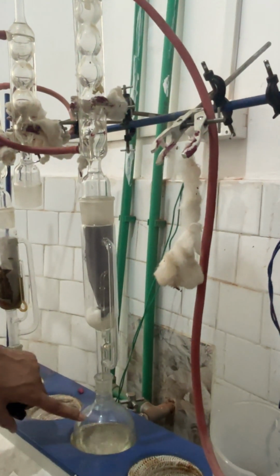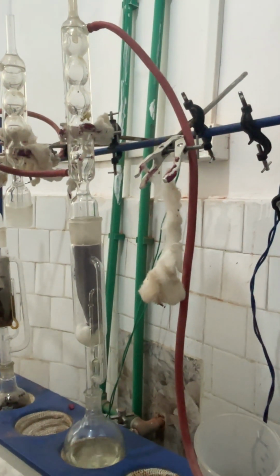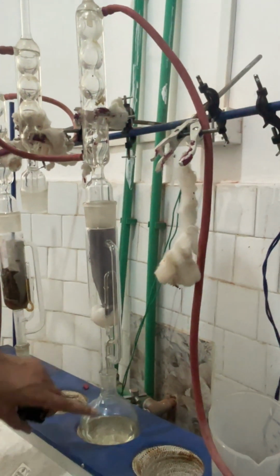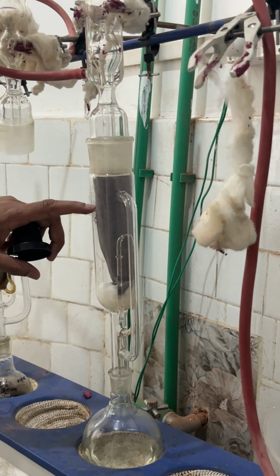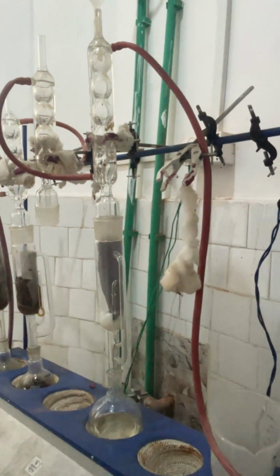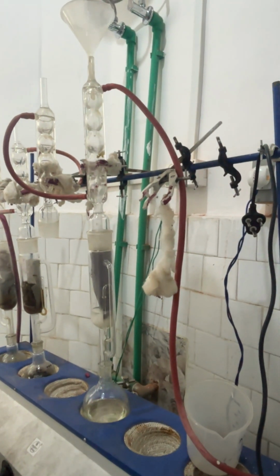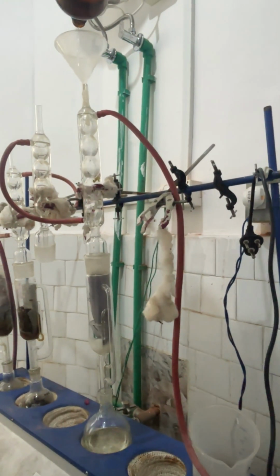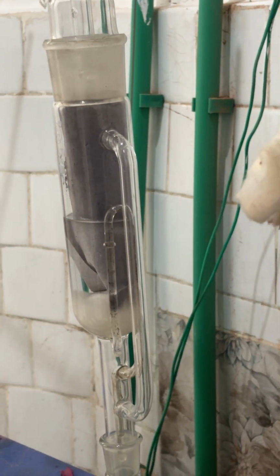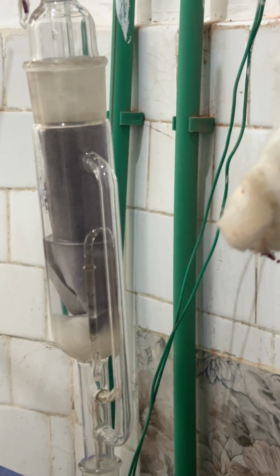So always we have to keep at least 1.5 Soxhlets, or 1.75 Soxhlets. So one Soxhlet we kept, because we want to ensure that if we only keep this much hexane, it will all evaporate and come in this. So this will be empty, so this will burn your compound. So it's better to have around 1.5 Soxhlets. So we'll keep adding it. Yes, sir. So now it reached here. Okay. So we'll start. Okay, so the capacity is 500 ml, so we're good.